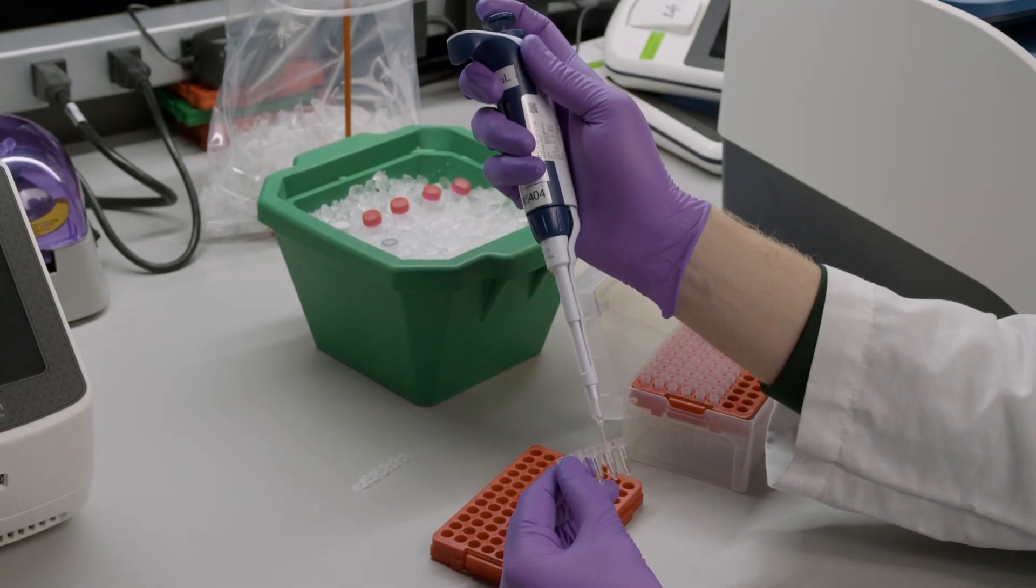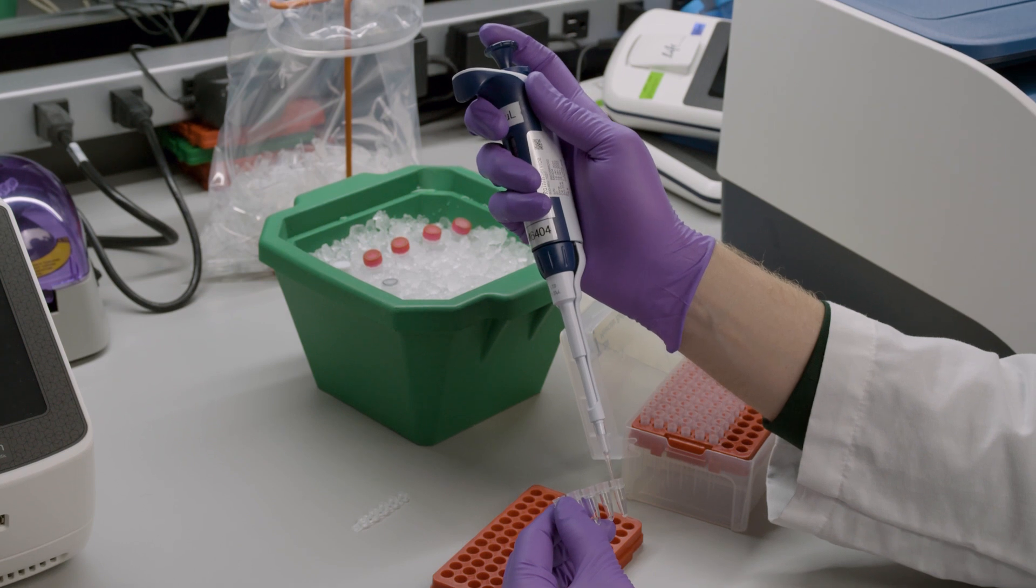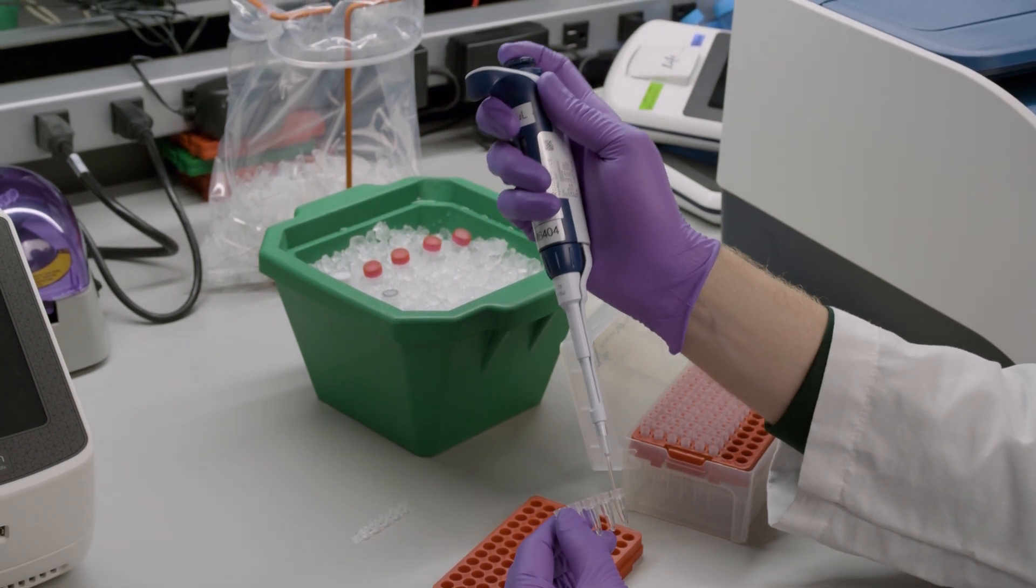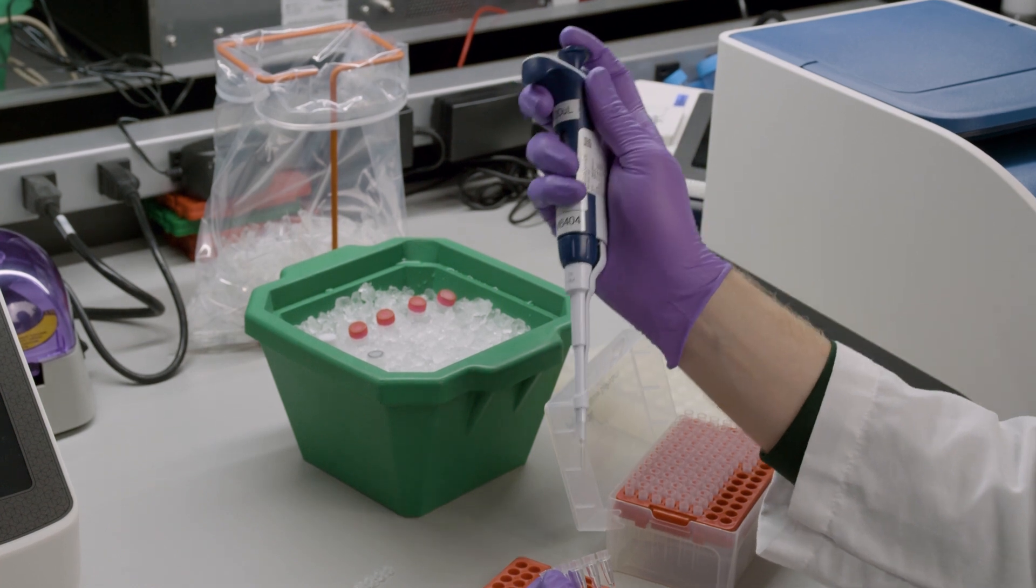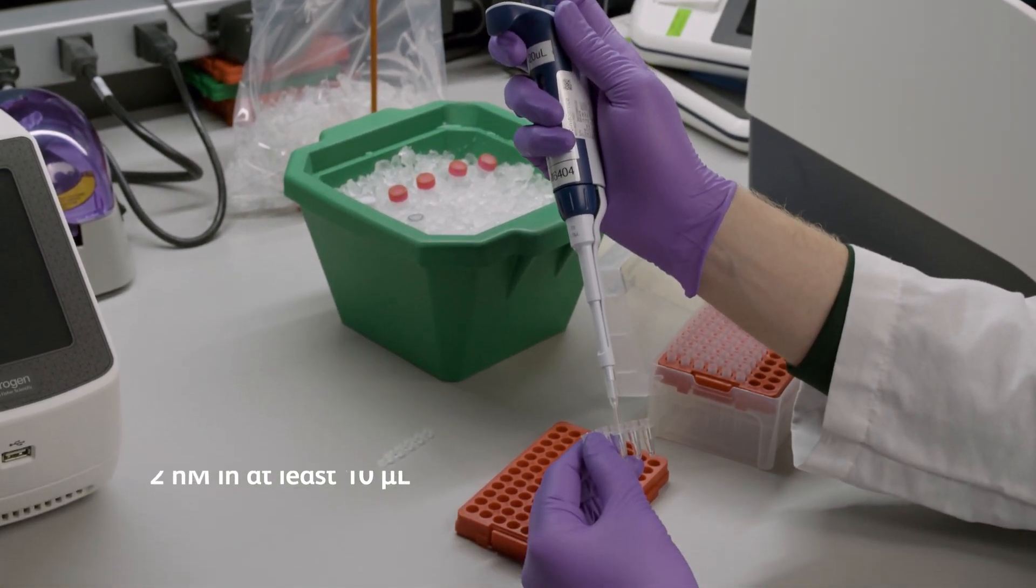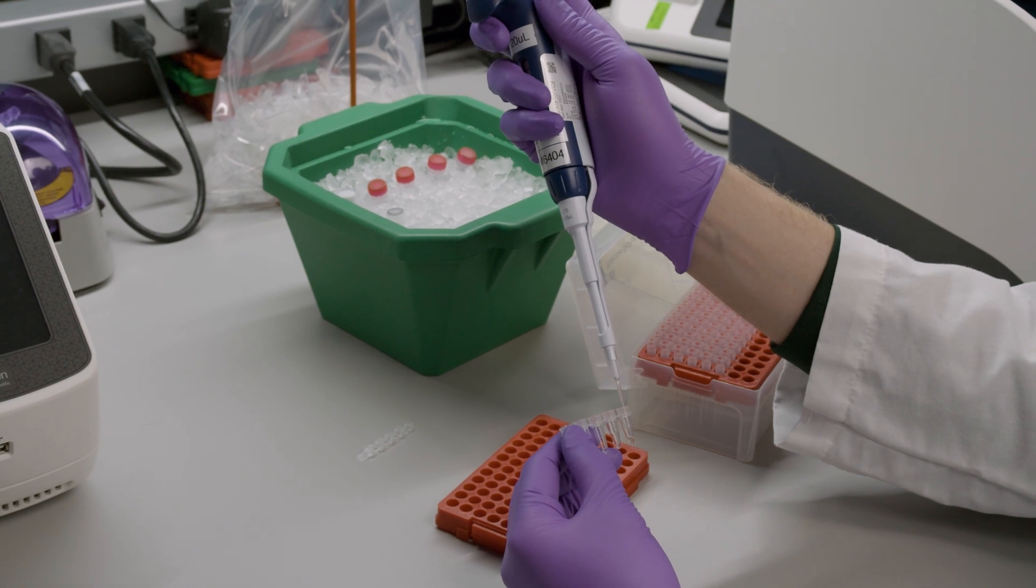With successful QC, we can proceed to generating sequencing libraries from the RPE amplified products. First, aliquot and dilute some of the RPE amplified product to 2 nanomolar and at least 10 microliters if it is higher than 2 nanomolar.